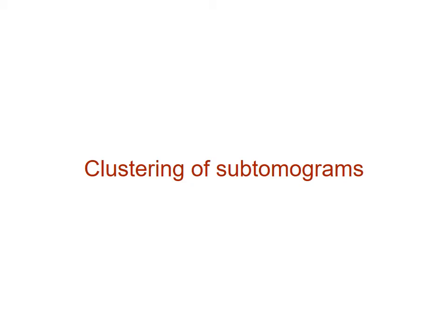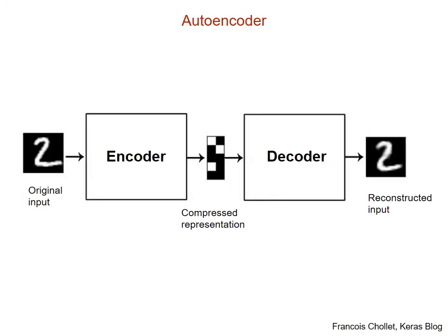Therefore, we have also looked at unsupervised deep learning methods to classify such subtomograms through clustering. So we have developed a method that is based on the convolutional autoencoder.